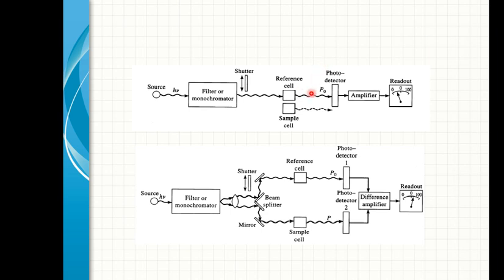So when we replace the reference cell by the sample cell, where the concentration is theoretically 5 but the actual concentration is unknown, the unknown concentration X of the sample produces some absorption, say 0.23. So by multiplication, we can know the concentration of the sample.